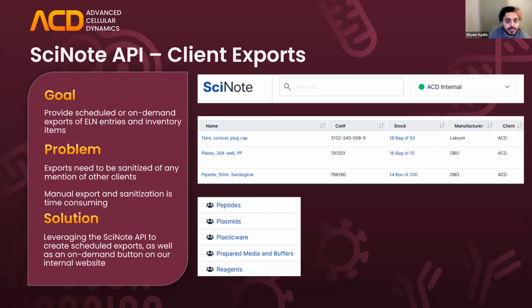Okay, so the first use case, and these are a little bit more high level than Dave's use cases, but we have structured our SciNote in a way that each client basically is its own team in SciNote, and then we have shared inventories to share a lot of common reagents. But we also want to be able to specify that some reagent was paid for and is specifically for use by a client, and we want them to be able to see our actual stock of that in real time, because we've had clients that really do want to know how we're using all of the money that they're giving us.